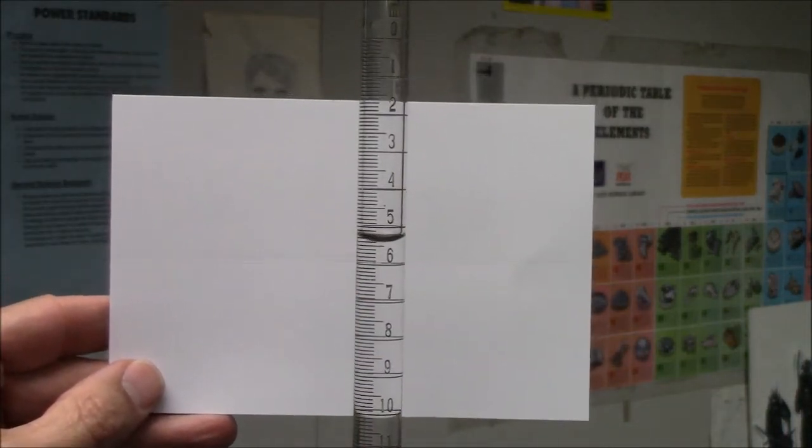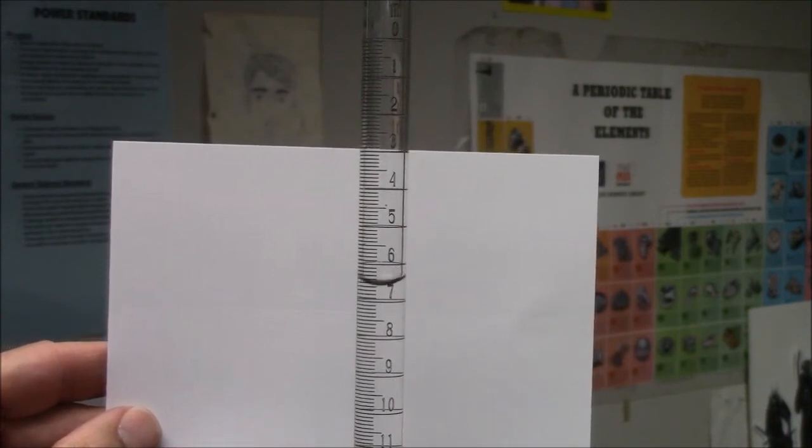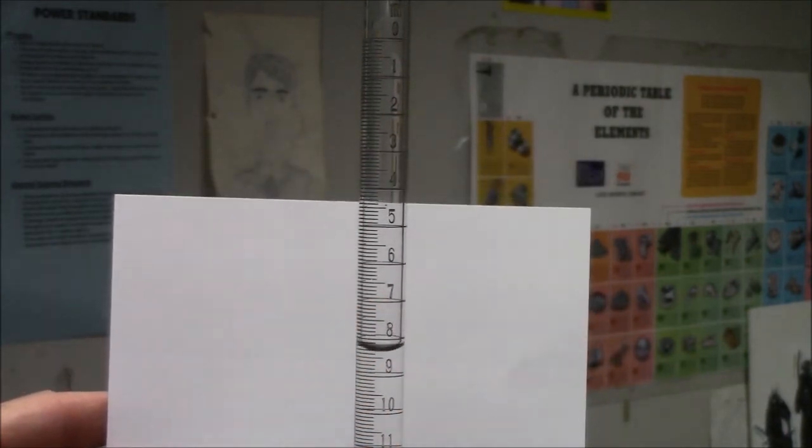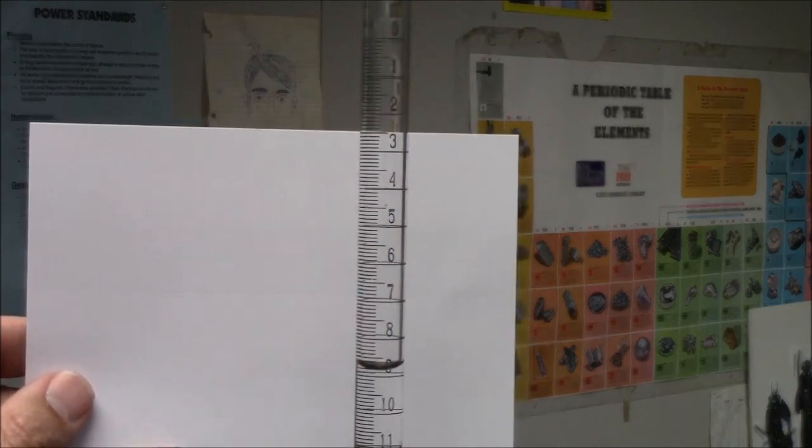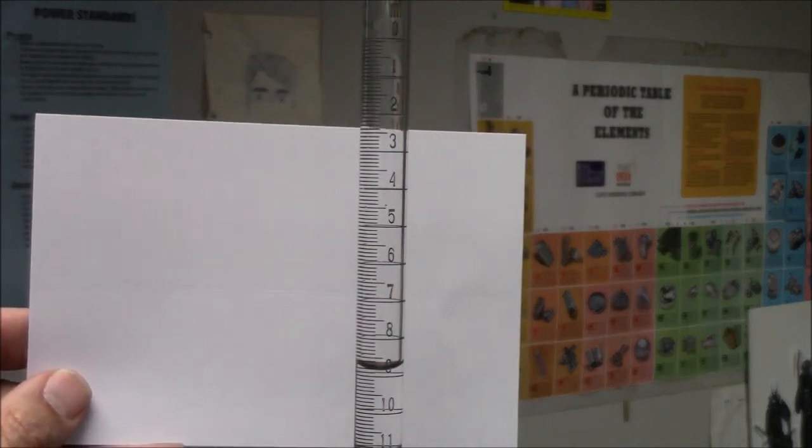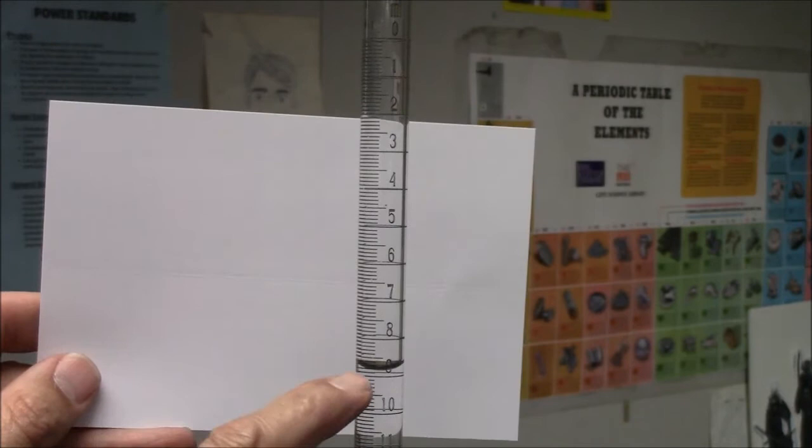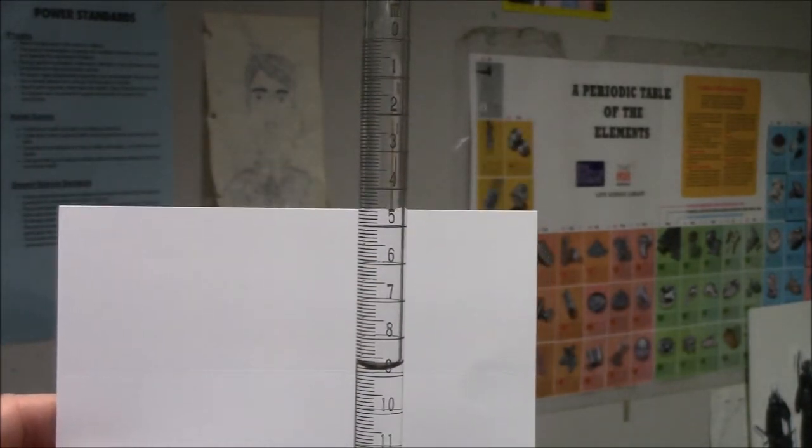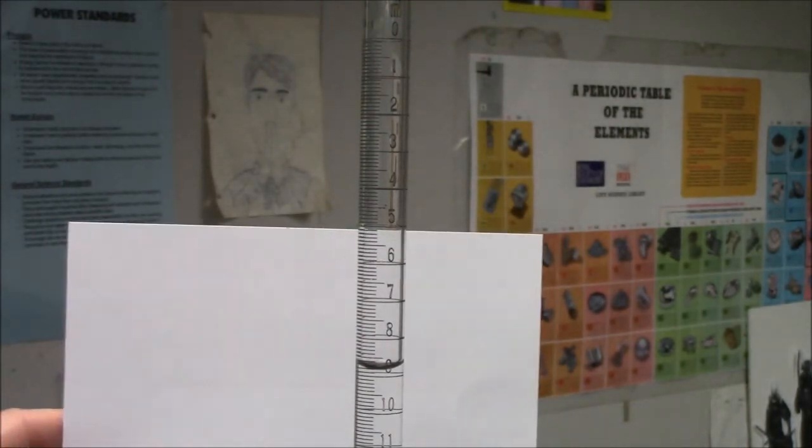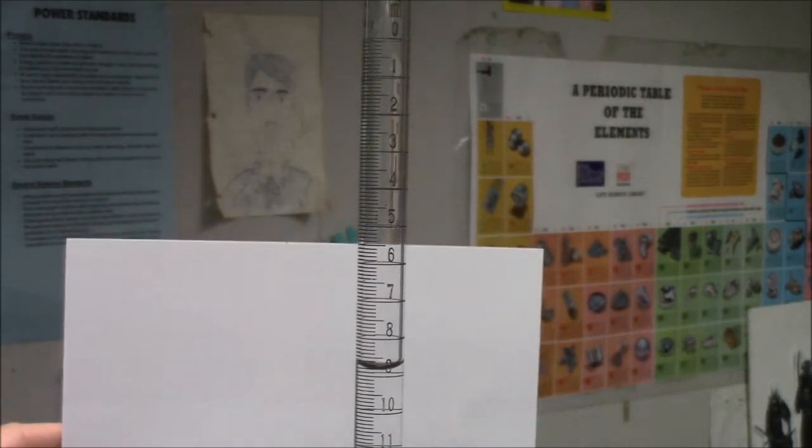I will now allow the solution to drop out. You can see the water level dropping. I've stopped it at eight point eight milliliters. Five point four to eight point eight. Three point four milliliters have come out of the burette. I never care what's in the burette. Only what's come out.